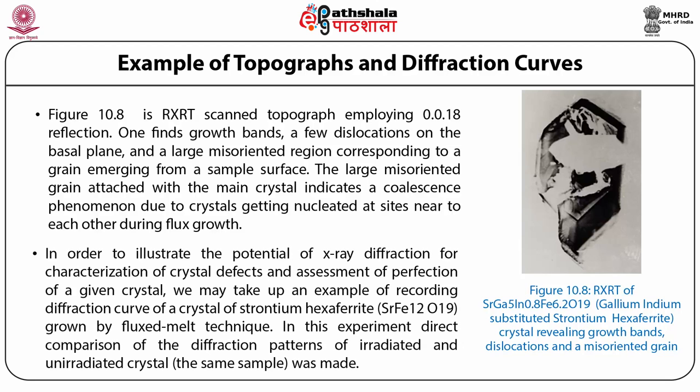In order to illustrate the potential of X-ray diffraction for characterization of crystal defects and assessment of perfection of a given crystal, we may take up an example of recording diffraction curve of a crystal of strontium hexaferrite whose chemical composition is SrFe12O19, grown by fluxed melt technique. In this experiment, direct comparison of the diffraction patterns of irradiated and unirradiated crystal within the same sample was made.